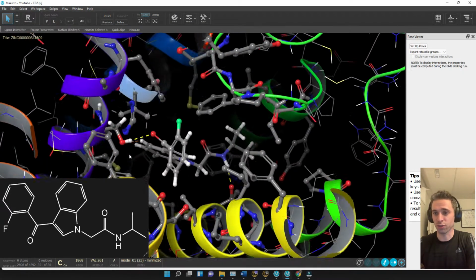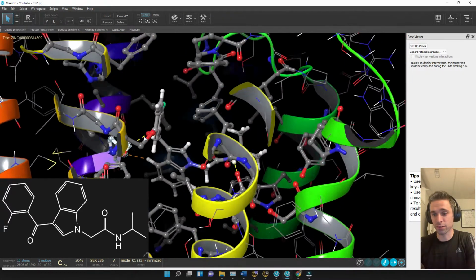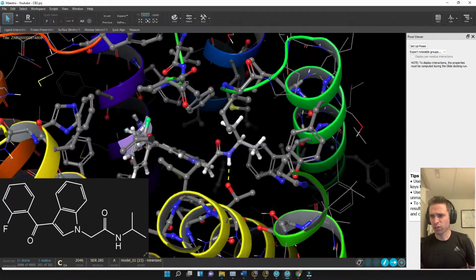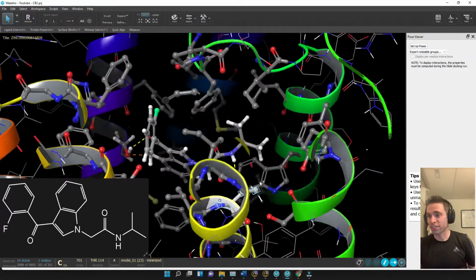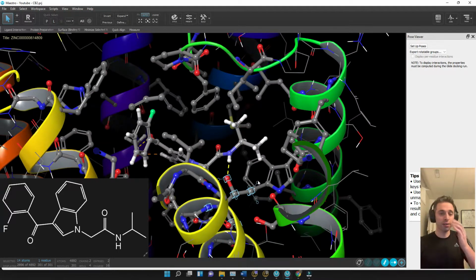Let's go to residue for selection. Serine 285, perfect. So we have that hydrogen bond. We also have another hydrogen bond to, what is that, threonine? Threonine 114, interestingly enough. There's something kind of cool I want to show you guys.